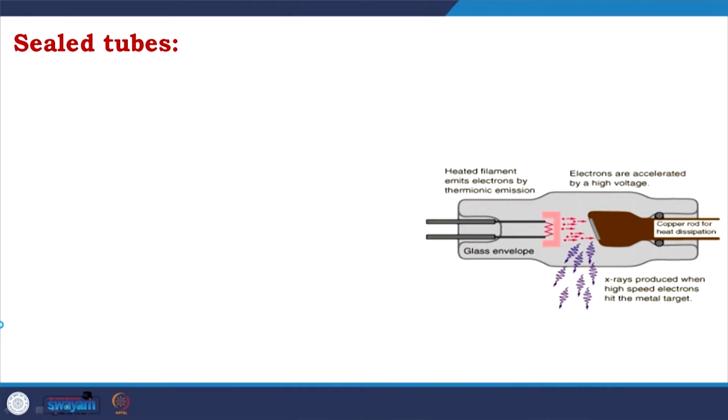This is again very important to remember. X-ray is used because the range of X-ray is in the range of atomic distances, the bond distances. If you look at a protein, there is carbon, nitrogen, oxygen mostly, and those are bonded within around 1.5 angstrom. So, that is why X-ray works perfectly. So, we understand how X-ray is generated, but what is the instrumentation through which X-ray generation is done?